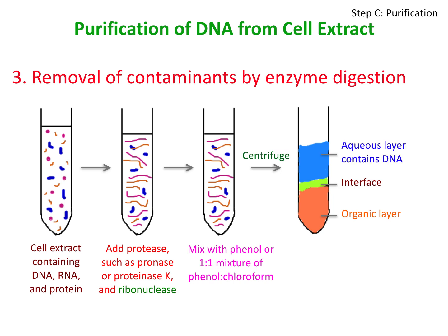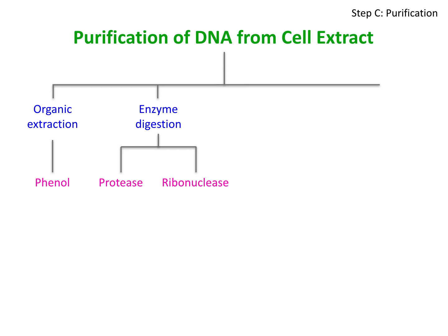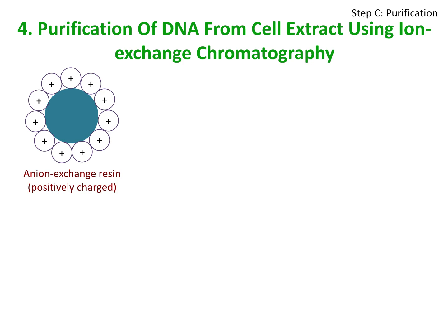Whether it is organic extraction or enzyme digestion, both the methods are slightly laborious. A slightly faster method is ion exchange chromatography. Here, an anion exchange resin is used. This method makes use of the different electrical charges that are present on different molecules to separate these molecules from a mixture. In ion exchange chromatography, a chromatographic matrix or resin is used, whose particles are electrically charged.